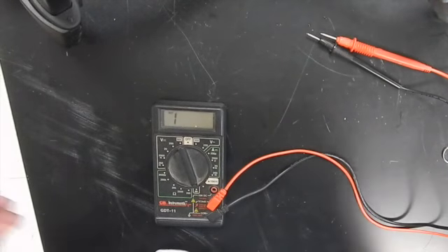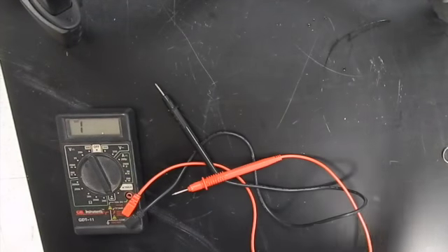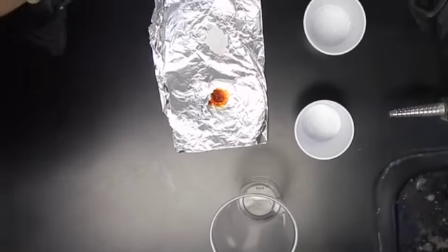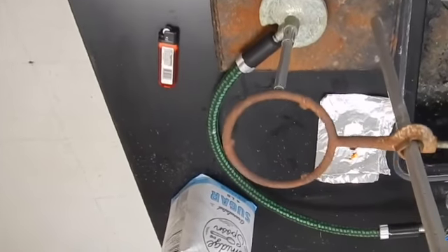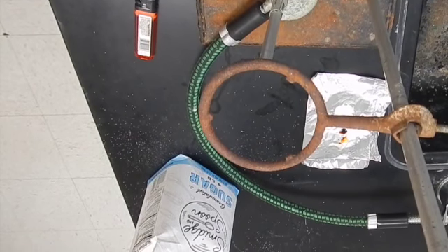Alright, so now that we have our base for covalent versus ionic, with sugar being the example of covalent, and salt being the example of ionic, now we're going to do it with the unknowns. First, we will check the boiling point of these and compare that, and then we will go and do how well it conducts electricity.